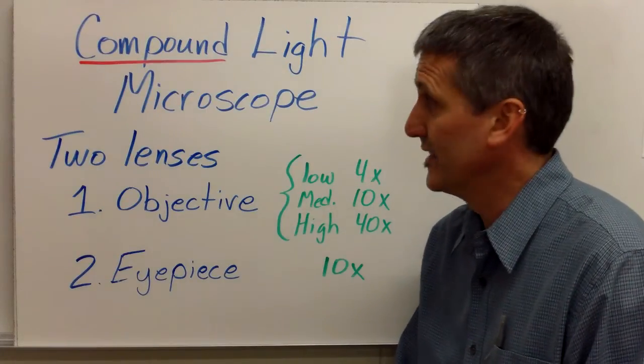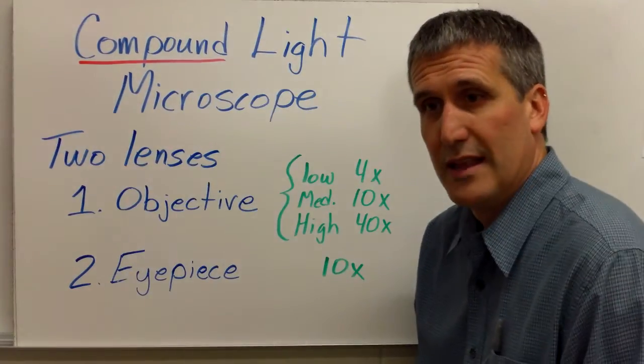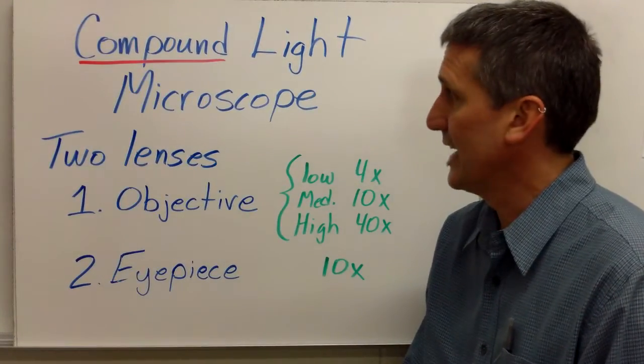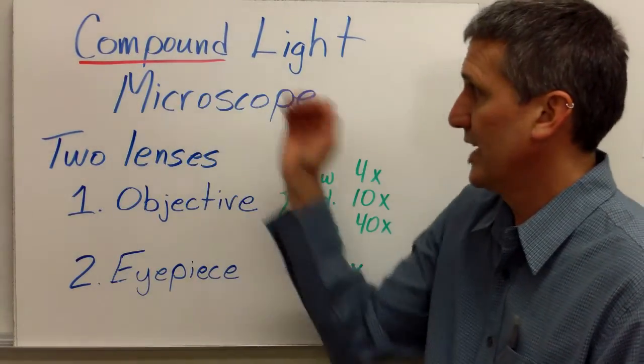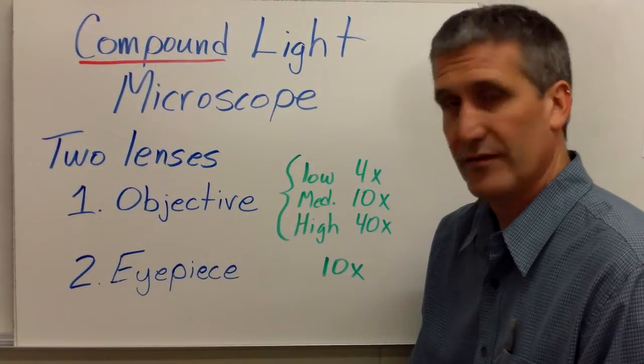Welcome, this is Mr. Berger and in this video we're going to go over the essential understandings that you need to use a compound light microscope efficiently and effectively.